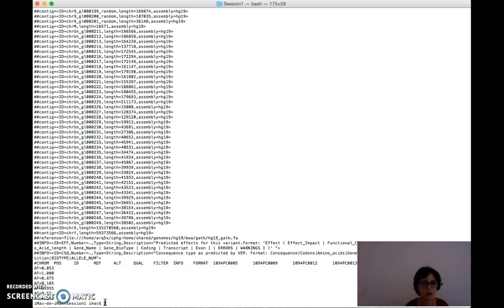Okay? So depending on the separator you use, you can query these different fields in different ways. Remember this for the last part of your assignment. You will be needing it. We have different exercises to do using these very basic commands. And this at least will show you that if a sequencing platform is giving you this kind of file, you can easily parse it. Remember that the classical way to parse it is really not useful, like, for example, opening it in a text editor and searching one by one using Control F, or using an Excel file to represent your data or to extract some information from it. This is really not useful. But using the command line can bring you a lot of ease in parsing these kinds of files.